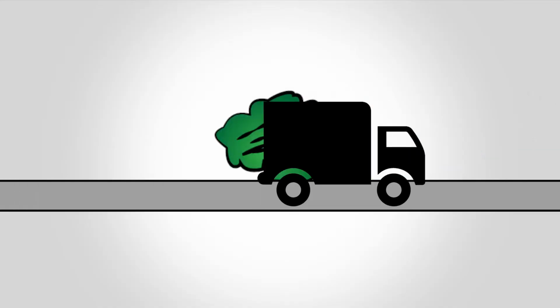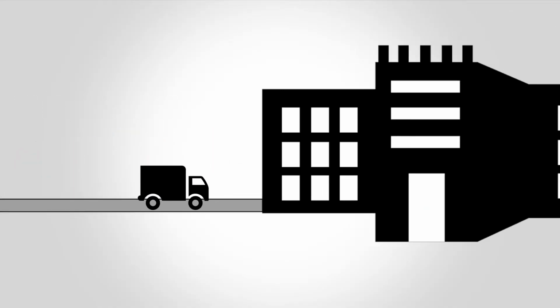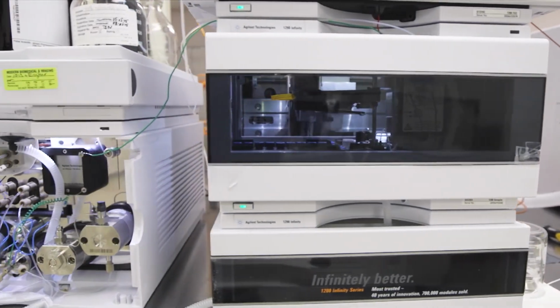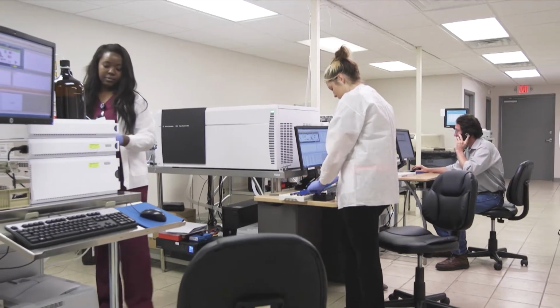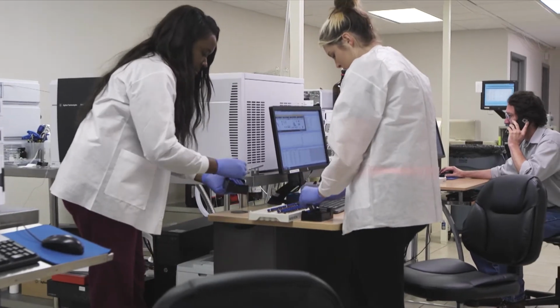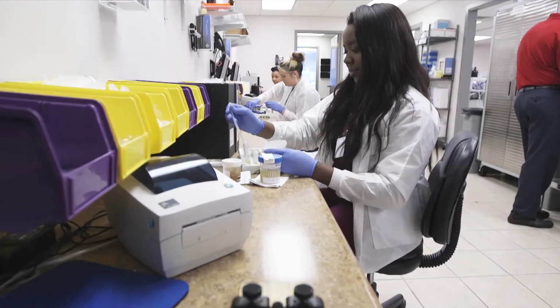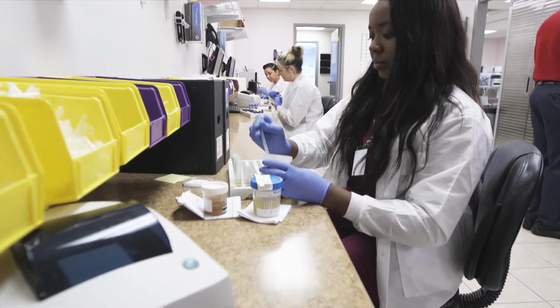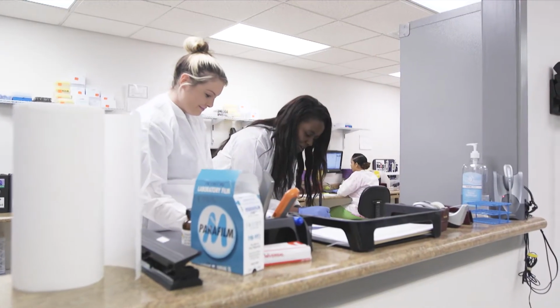Every morning, the shipping truck pulls up to our office with about 200 to 300 boxes of specimens. Immediately, our lab gets to work. We have a department called the accessioning department. Their job is to put them in little carriers and trays and open each one and put them in cups and keep all that information together for that specimen. They accession it. They start a tracking purpose.